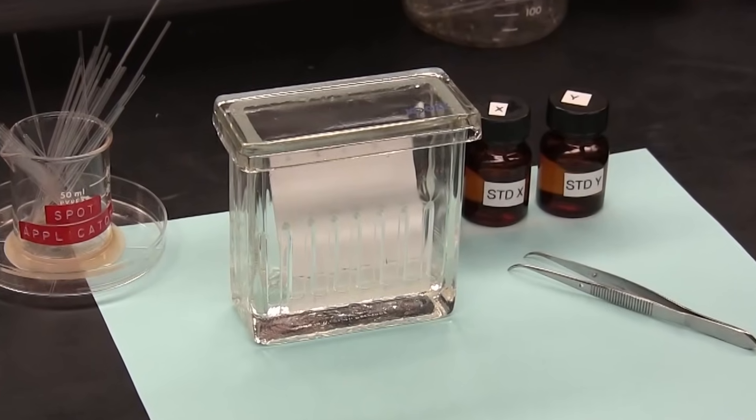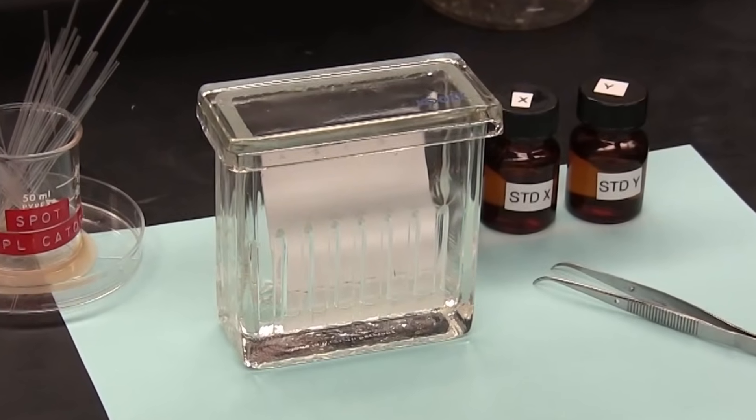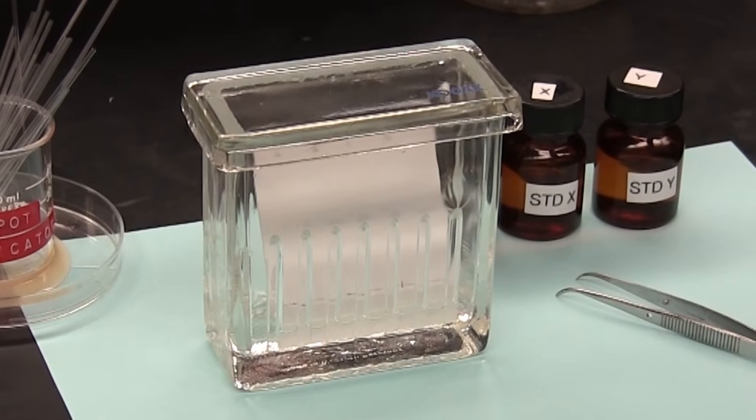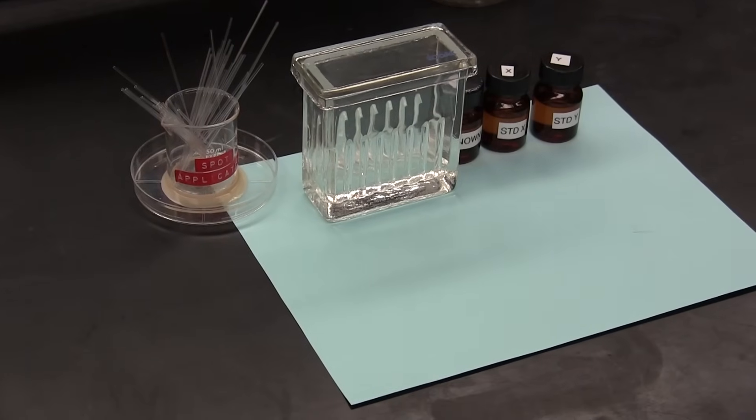Separated components can be identified by comparing how far they travel along the plate relative to reference material, also known as standards. Let's take a closer look.